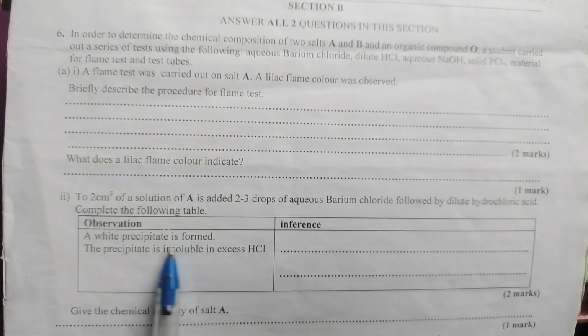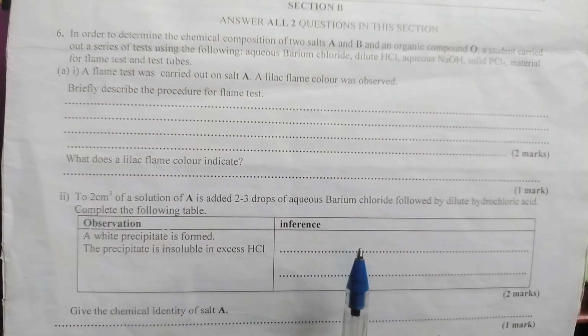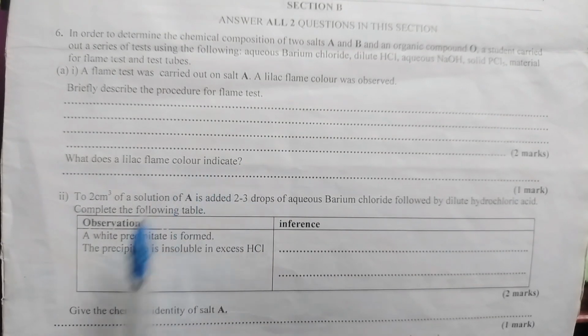This is it here. The precipitate is formed. The precipitate is insoluble in excess acid. Inference, presence of the sulfate ion, the one with 4, SO4 2-. Give the chemical identity of A. We have identified the cation as potassium ion, and we have identified the anion as the sulfate ion. So the chemical identity of A is potassium sulfate. Potassium sulfate. So that's the chemical identity of A. We come to the end of our video.